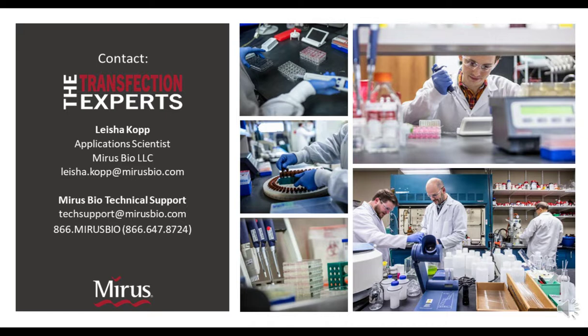And so we're actually in the process of trying to determine exactly where our limits are for perfectly stable complexes, and then what marginal decrease we would expect to see at certain time points. But up to 60 minutes, we do know that things are very stable.